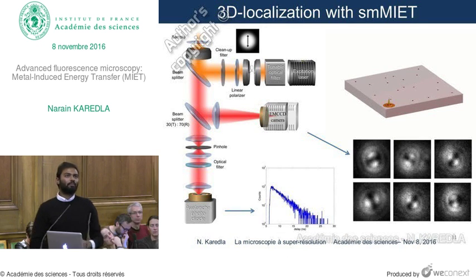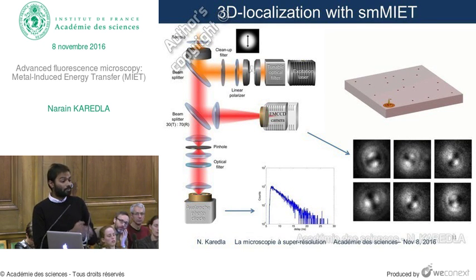So first, for scanning, you now have rapid scanners, which have a dwell time of 2 microseconds per pixel. You're right, you need enough photons. Sure. There are also lifetime cameras now on the market, which can image live. So what you're measuring is the average height of your molecule during the scan.